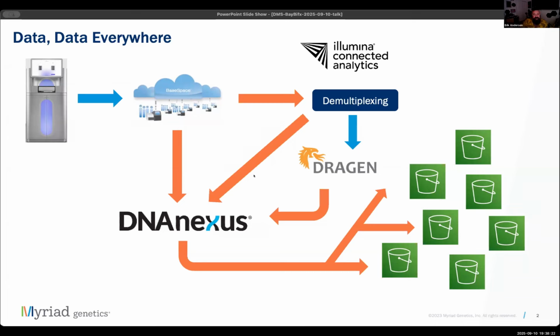All of this is compounded by scale. We expect to handle hundreds of millions of files and petabytes of data across our past, present, and future assays. It turns out addressing all of these concerns across so many platforms with such a complex graph is a bit of a novel problem. We spent months hunting for a vendor offering that could directly handle our needs and came back empty-handed.